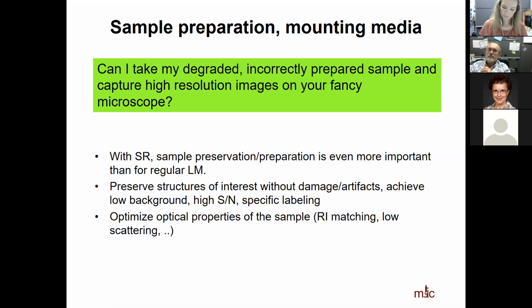Okay. Well, you could consider expansion microscopy. Because that mostly involves wet bench work, and then you use the same microscope on the expanded sample. Right. And hopefully get a much higher resolution that way. I mean, that's one way to do it.